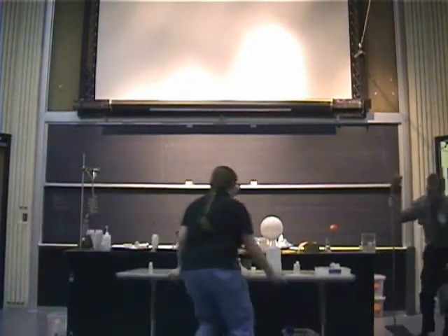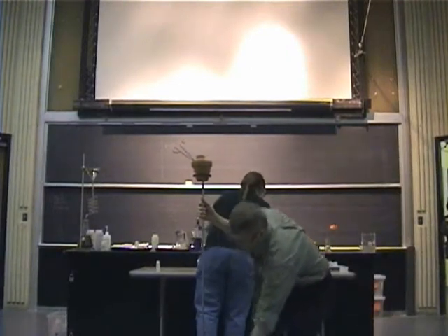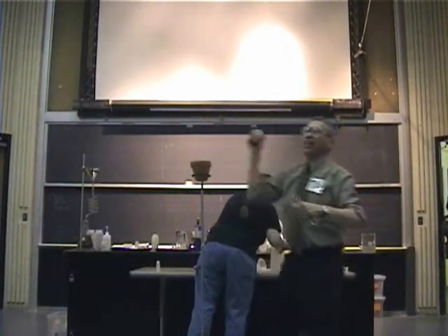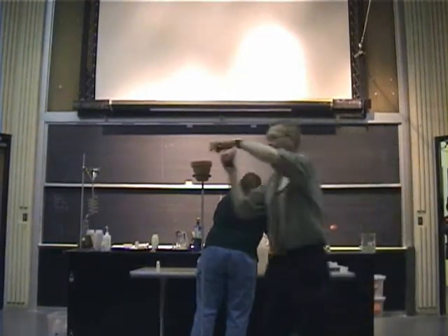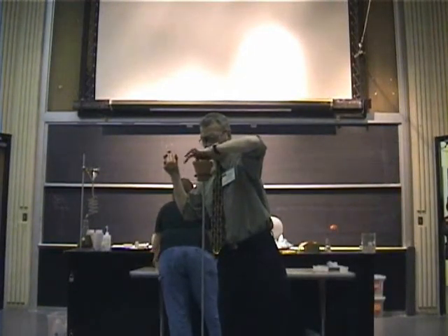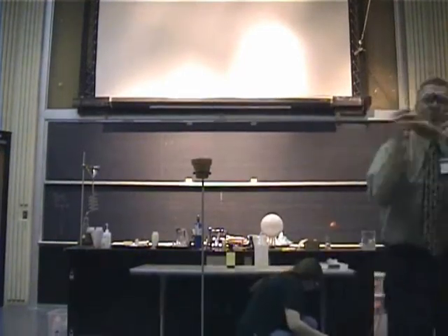One of my favorite chemical reactions — I seem to like the ones that give off a lot of energy. So here I have a mixture of iron oxide and aluminum, commonly called thermite.